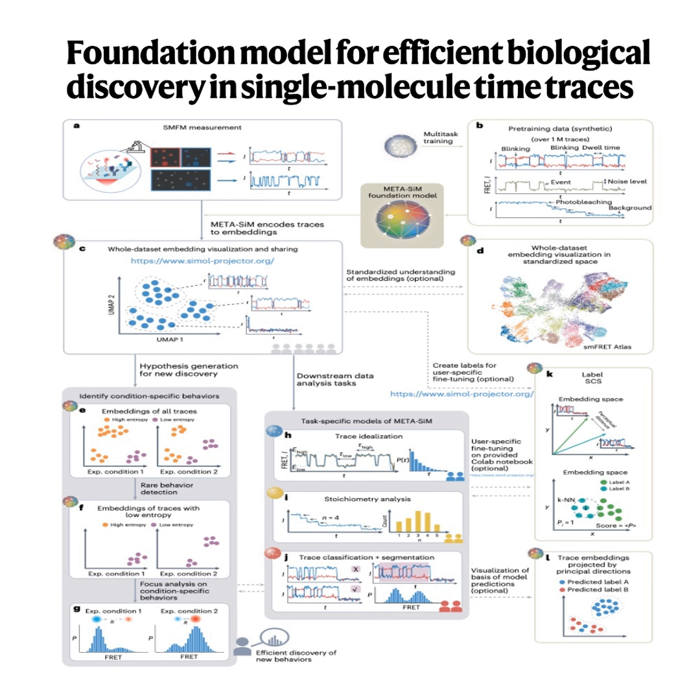And the big benefit of this foundation model approach is efficiency, right? Because it's already learned so much. Huge efficiency gains. Since META-SiM is pre-trained on that giant synthetic dataset, researchers don't need to start from scratch. When they want to apply it to their specific biological system, their protein, their RNA, they don't need another massive training dataset.